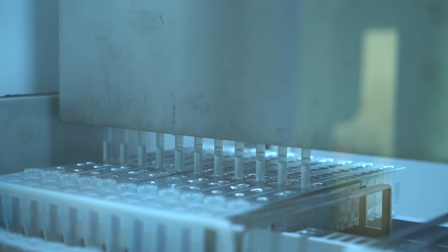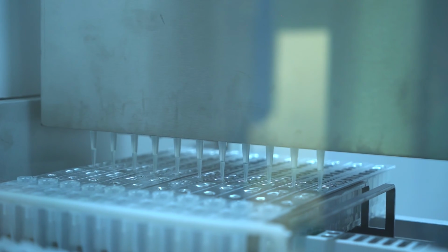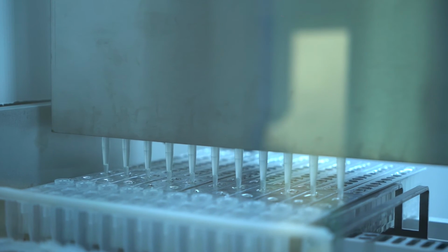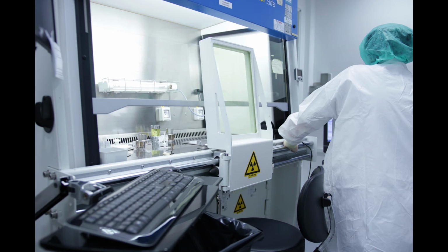Notably on top of these requirements is that generally it should be a negative pressure environment. That is, air from the outside environment will be pulled into the laboratory area, rather than air from the laboratory leaching out into the outside world. This ensures that what goes into the laboratory stays in the laboratory, much like Vegas. Since you're working with more pathogenic organisms, this is where biohazard warning signs should start showing up if they haven't already. Generally speaking, biohazard warning signs would indicate that what you're dealing with is likely to be a concern.